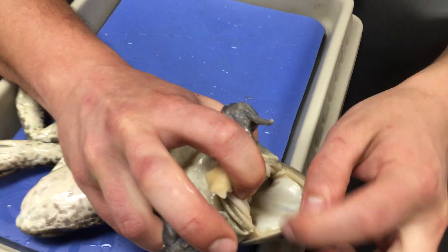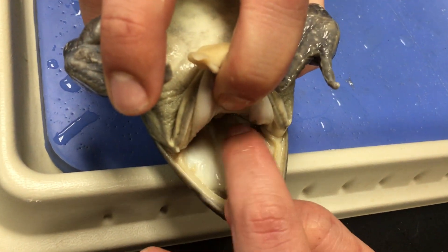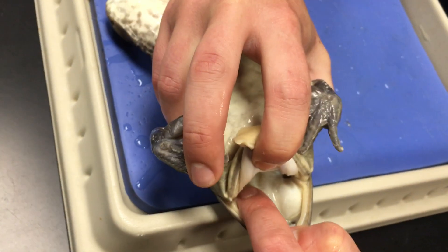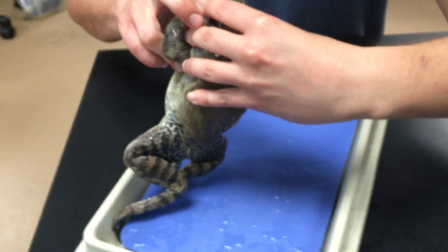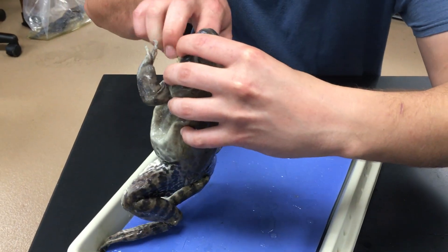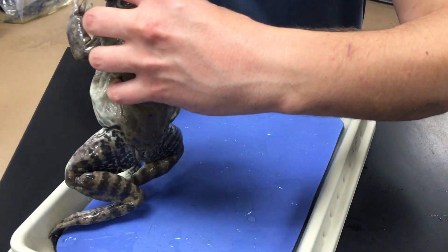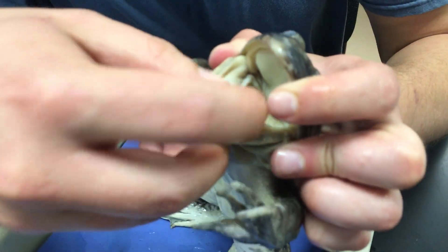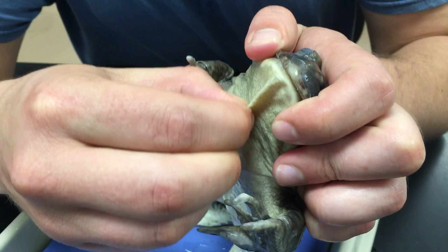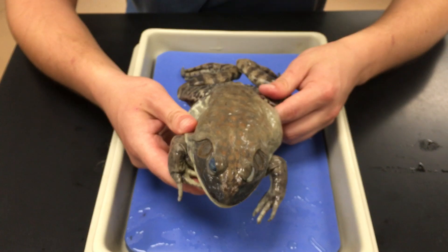We have the eustachian tubes — a pair of holes on either side of the head, just behind the eyes, lined up right with the tympanic membrane. You have eustachian tubes too; these are the air tubes that help regulate pressure in your ears. Then on the floor of the mouth we have the openings for the vocal sac. This sac on the chin of the frog will inflate, and males use that to call for females.